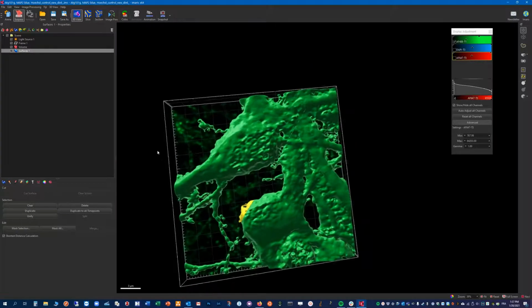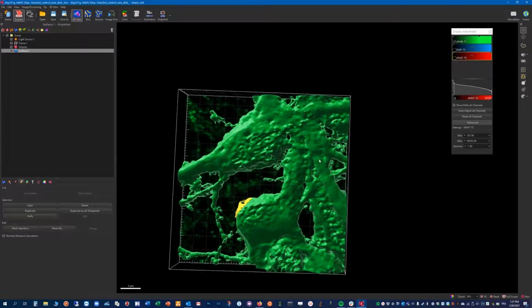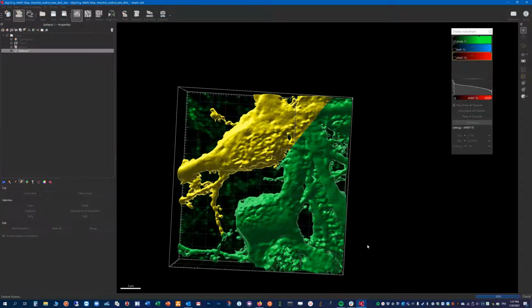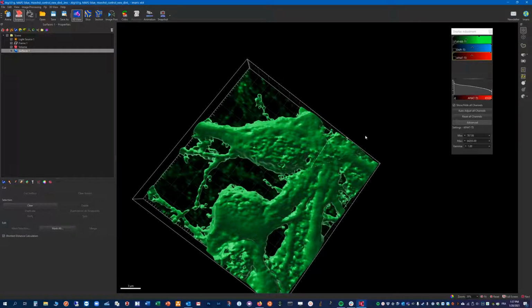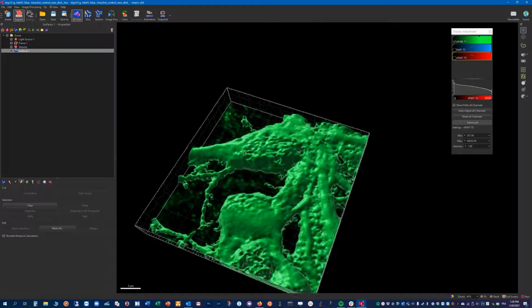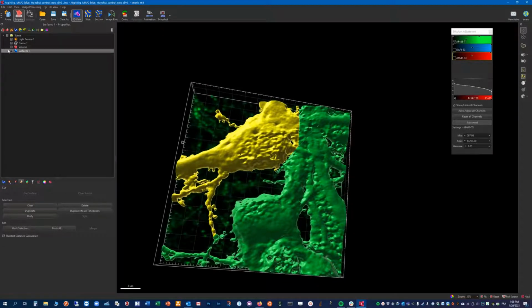Now let's try to cut it along this axis here. So we could multiply the cut lines like this. Let's cut this again, and let me just check with the object how it looks. Yeah, I think this might be safe. So we have one object here, and let's say this is our first cell.